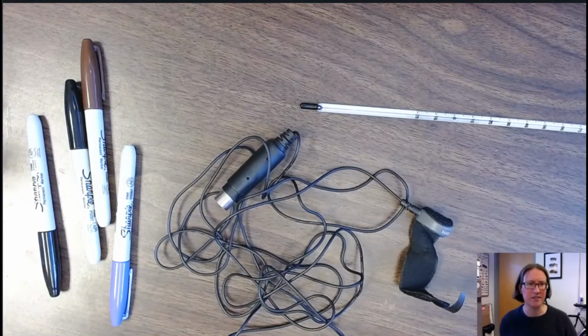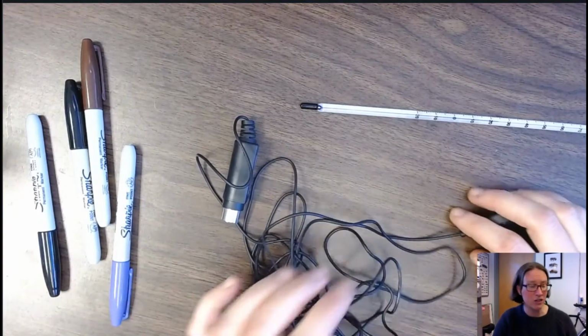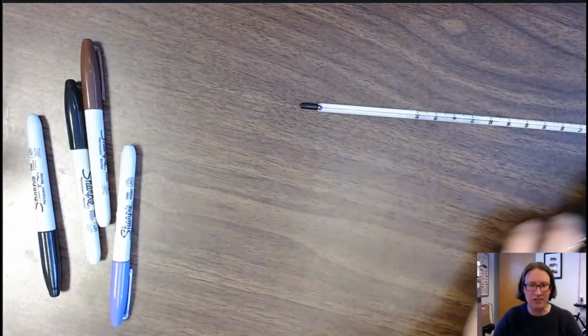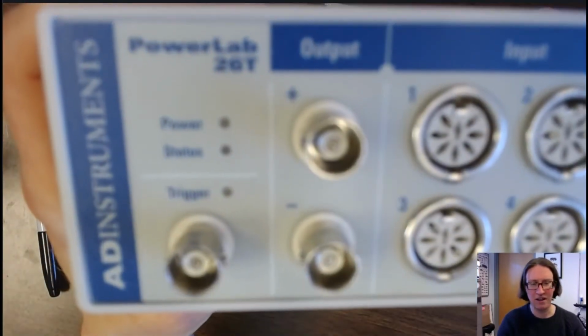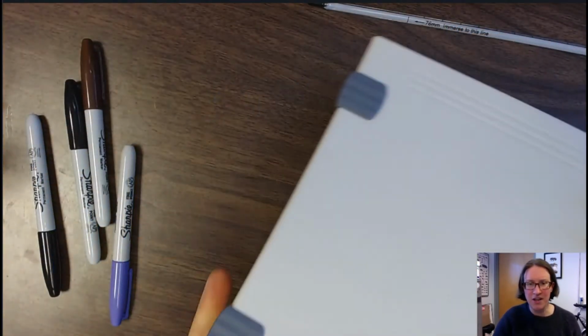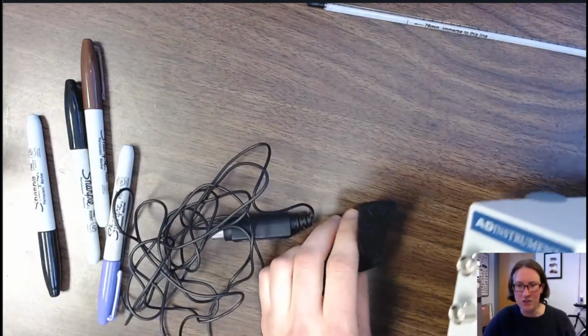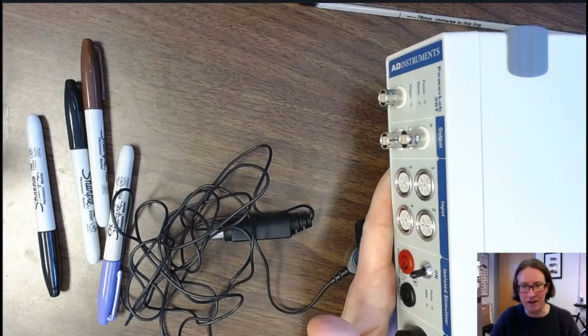So that's where the next part of the system comes into play. Once we've converted our pressure signal into an electrical signal, we're then in a position to connect that to a digital data acquisition system that can collect the data for us much more rapidly. And that's basically what the next pieces of hardware and software are configured to do. So this unit here, this is a Power Lab unit. This is a converter unit that will convert the signal from this pulse transducer into a computer readable form, so we can then digitize and display the output on a monitor.